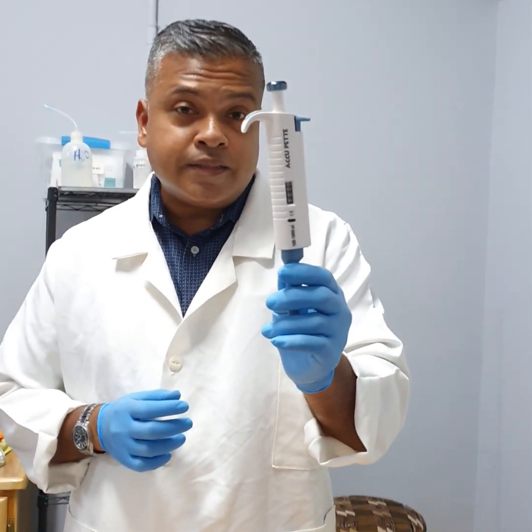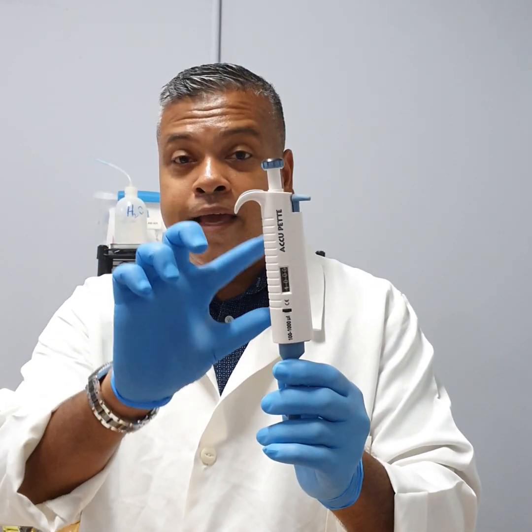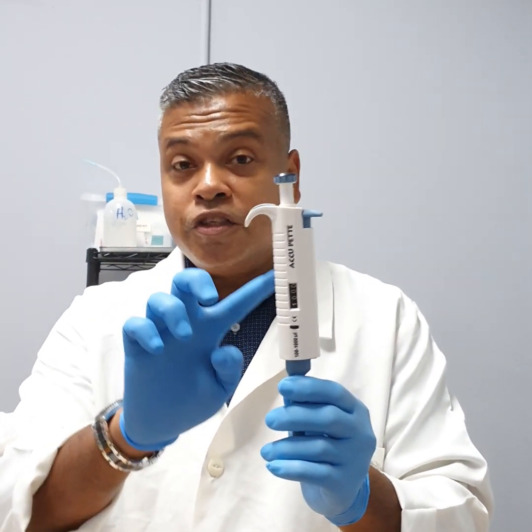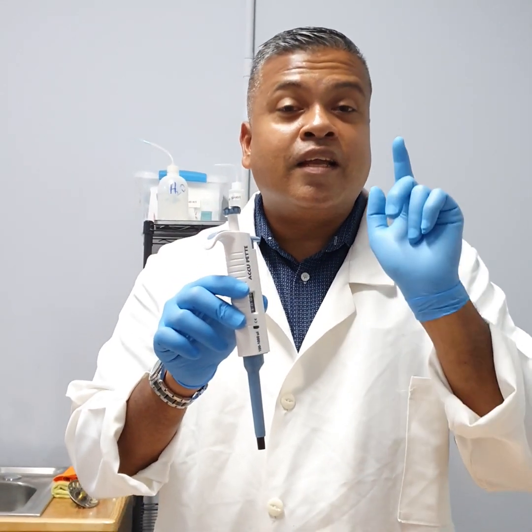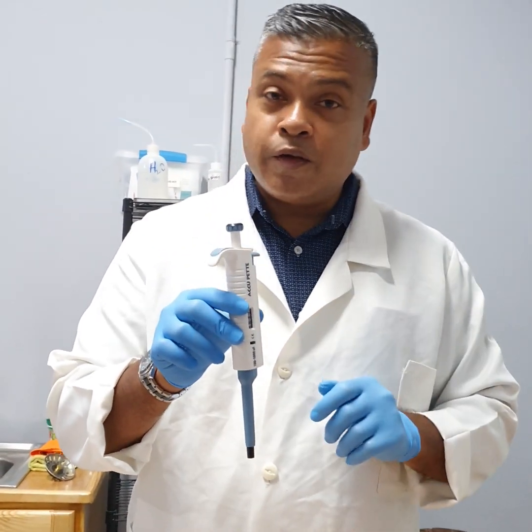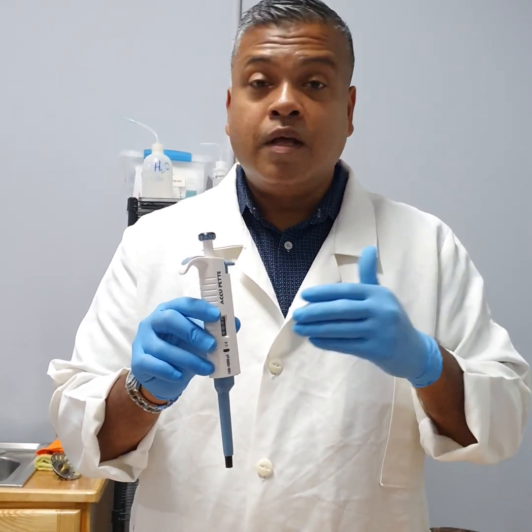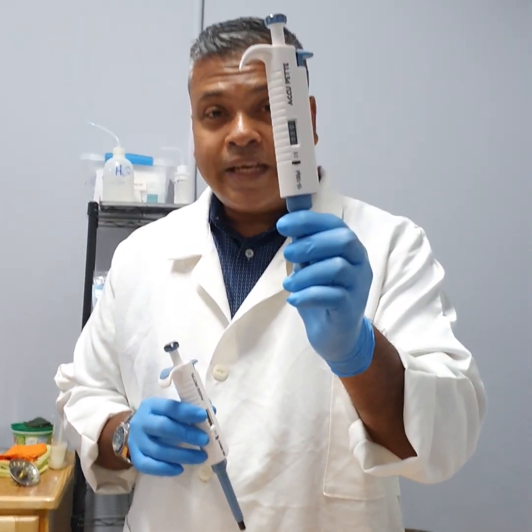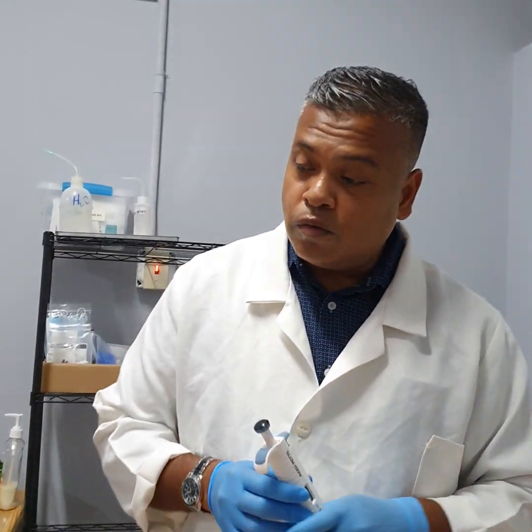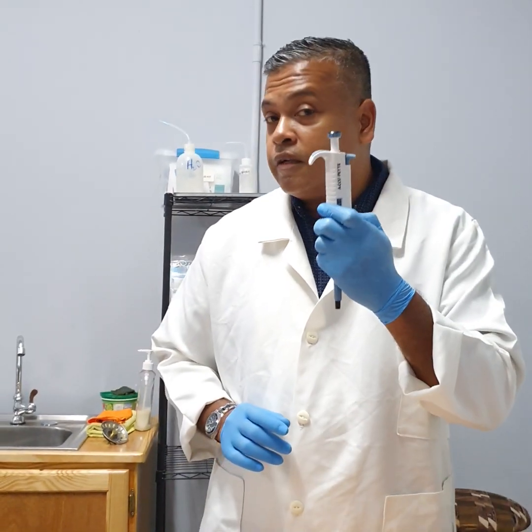This is an analytical pipette. It is designed with an air displacement plunger inside there to pick up or release a particular volume of liquid, a particular volume of reagent, a particular volume of patient blood or serum. We've got different sizes. I'm going to show you here now, for example, how very nice these fundamental tools are in the laboratory.